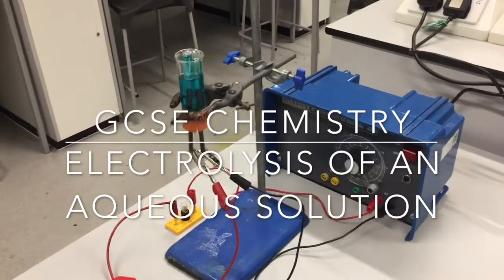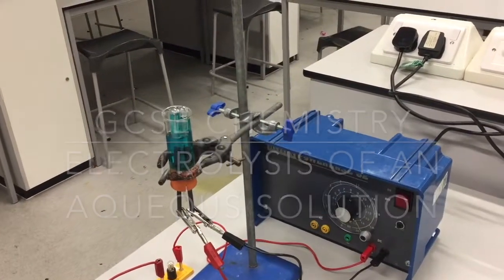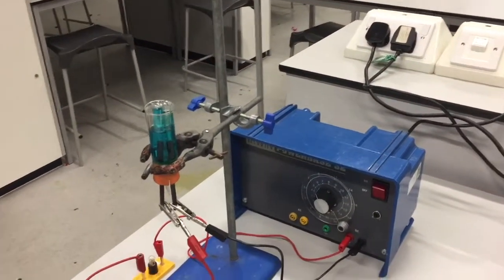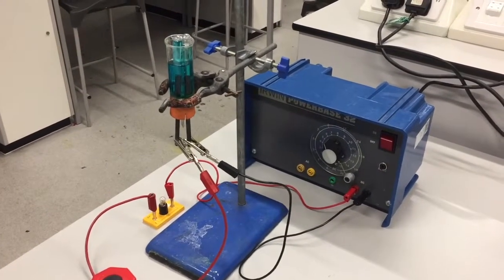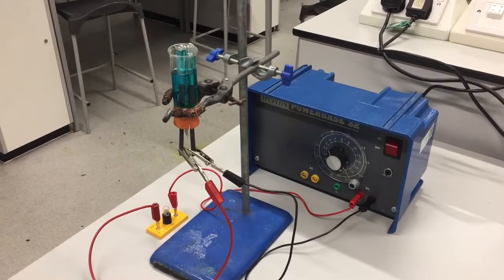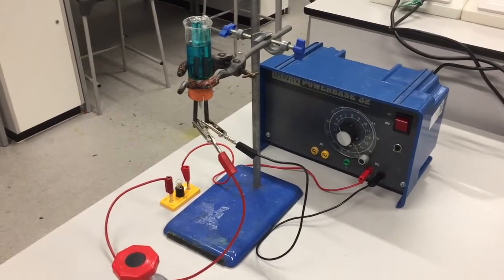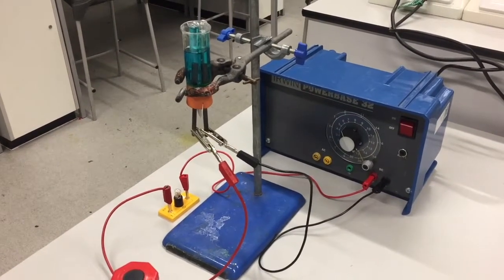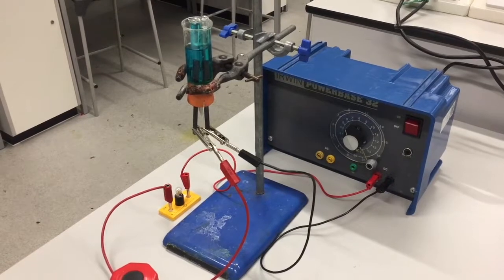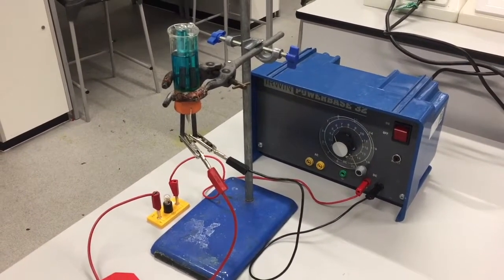This is required practical 9. Investigate what happens when aqueous solutions are electrolyzed using inert electrodes. So this comes up in several specifications, including the AQA Trilogy and AQA Chemistry awards. And what we're going to have here are 3 different examples of electrolysis where students are needed to predict what the products are at each electrode with an explanation.